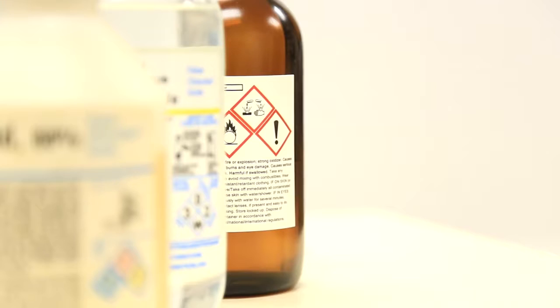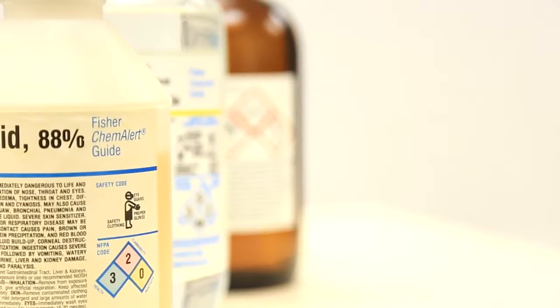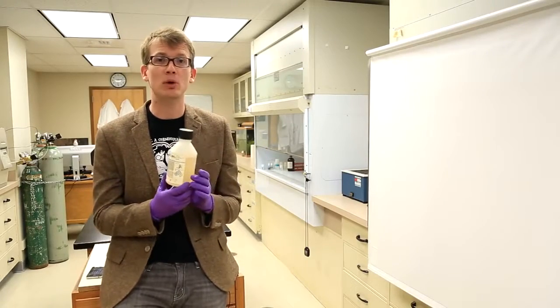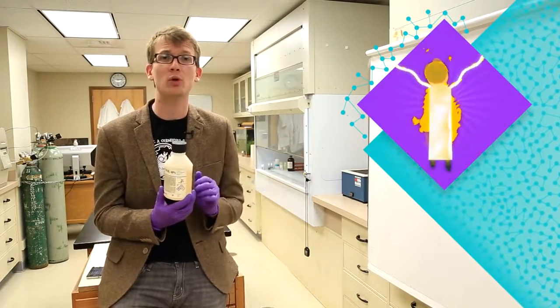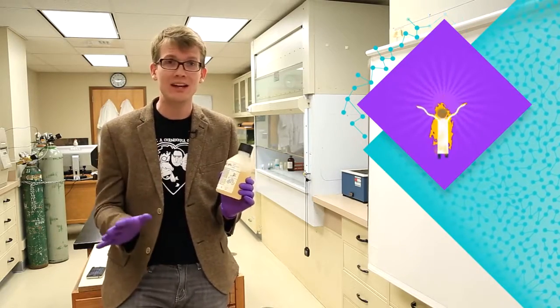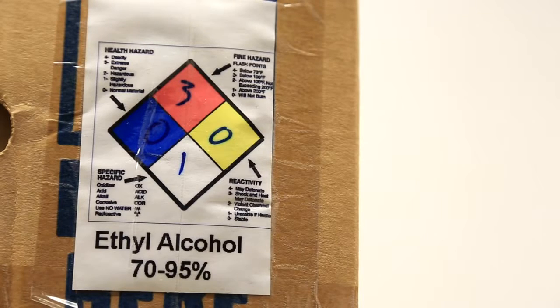You may have seen this little symbol before here. It's the hazardous materials or hazmat diamond, and it's got some useful information in it. Each little box is rated 0 to 4, 0 being no big deal, and 4 being be very careful. Blue is for health, the red is for flammability, and yellow is for chemical reactivity. A 4 in health means certain kinds of exposure will kill you. A 4 in fire is both very flammable and gaseous, so impossible to control outside of a closed container. And a 4 in reactivity means that it is capable of exploding at room temperature. The little area underneath is for any extra information, like if it's radioactive or reacts violently with water or something.